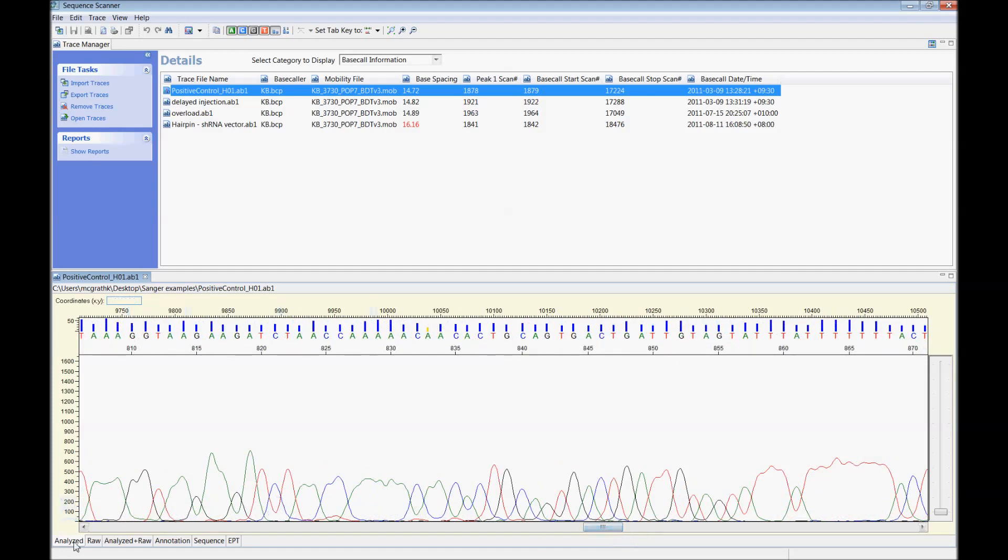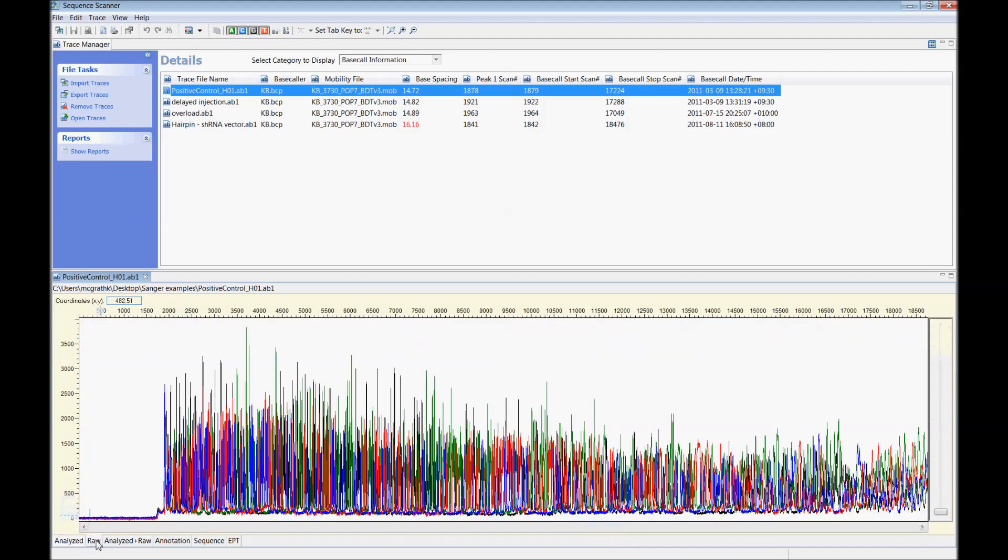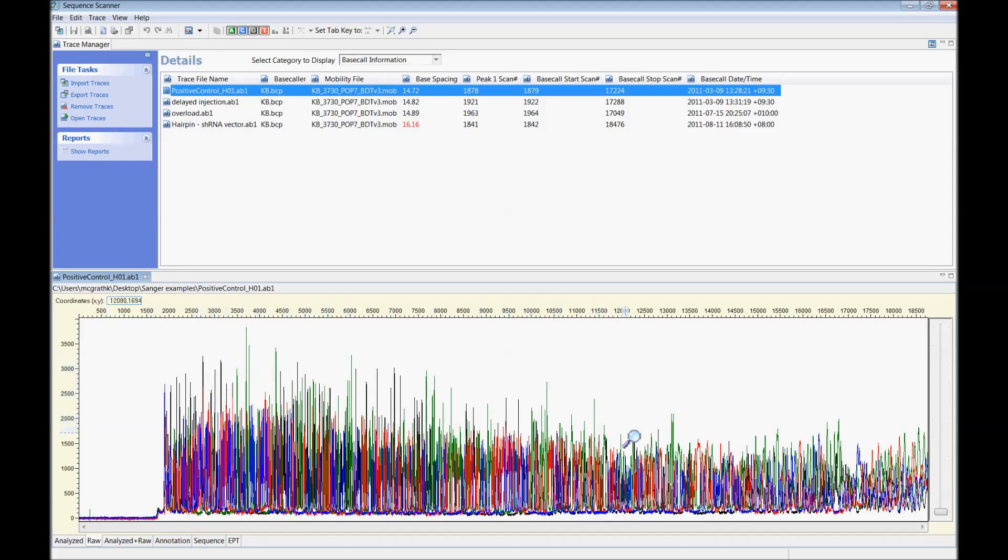Viewing the raw intensities shows a nice bright signal with intensities above the 2,000 relative fluorescent units level. There is also a gentle slope of signal along the read which is indicative of a good ratio of template and primer in the reaction.